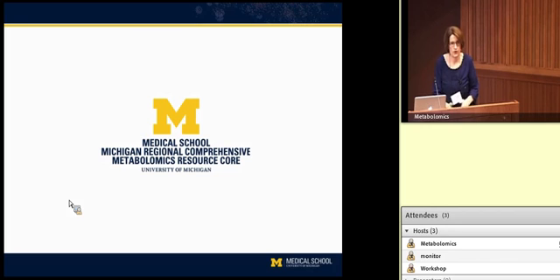We use that for the matrix effect in that area, to see if there are any competing peaks coming out that are causing any suppression, since if they're being retained for about the same amount of time, it'd be very close. So it really depends assay to assay. It's probably up to one internal standard for every 3 compounds if necessary, if we can't get the internal standards for those.